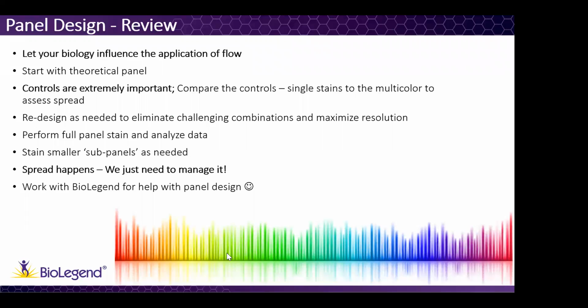And then just to review this all, let your biology influence the applications of flow. When you know what you are looking at and what you want to see, it helps you to design your panel. And then always start with the theoretical panel and remember the controls. I didn't talk much about them today, but you need to have all the controls that you would have with conventional instruments, single stain and non-stain controls. And this helps you to assess the spread.